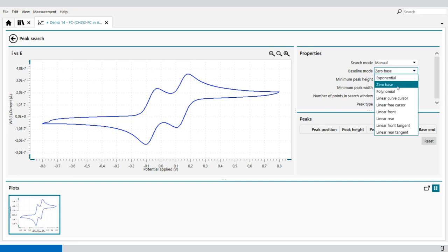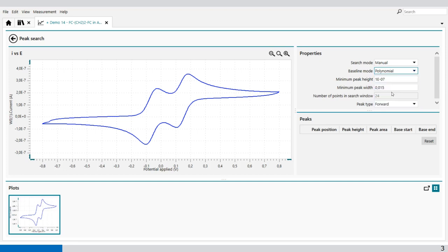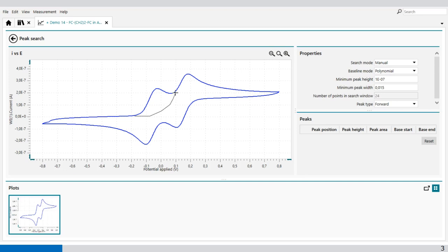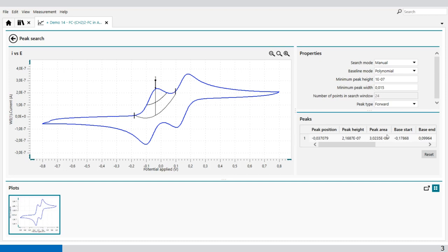Then we can set polynomial. With polynomial, you can select a few lines to create the baseline yourself. For example, with a few mouse clicks. Let's start from the beginning: one, two, three, four, five, six. And press enter on the graph, and it will automatically draw a line through the baseline. This is the polynomial. And then also we get peak position, peak height, and peak area, and the base.